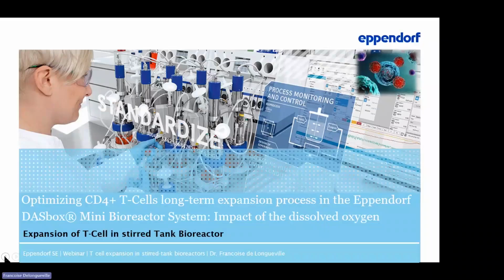Hello everyone. Today, cell therapies are continuously improving and providing new options to cancer patients. In this talk, I will present the optimization of long-term expansion of T cells inside the Eppendorf DASbox system, and more particularly, the impact of dissolved oxygen on this culture.